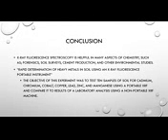X-ray fluorescence spectroscopy is helpful in many aspects of chemistry, such as forensics, soil surveys, cement production, and other environmental studies. X-ray fluorescence spectroscopy works by the excitation of a sample via incident beam. Once the sample is excited, the instrument produces a spectrum of characteristic wavelengths to help determine what atoms are present in a sample.